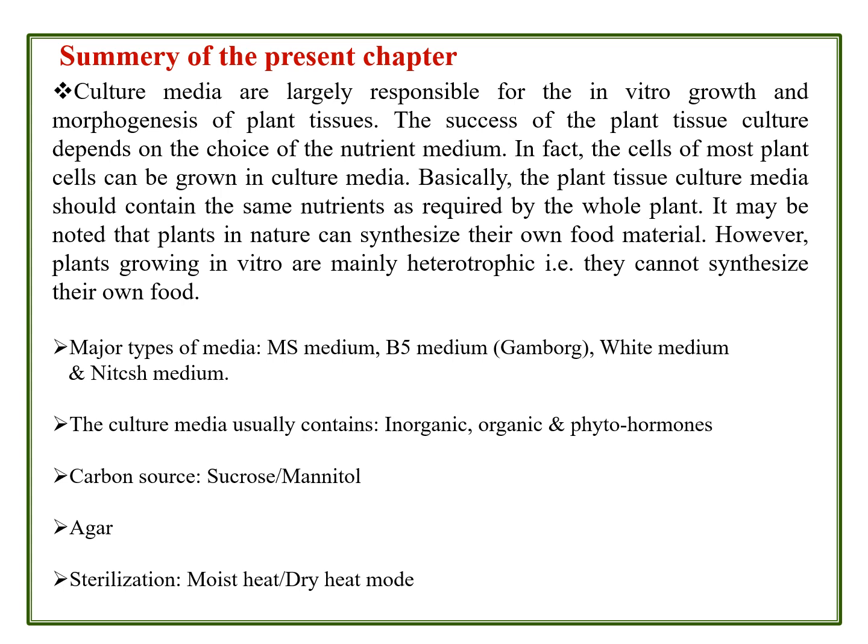And sterilization is possible with the moist heat or dry heat mode. For moist heat, for example, a simple autoclave or a simple kitchenware pressure cooker can be used. In dry heat mode, glassware and metalware can be sterilized effectively.